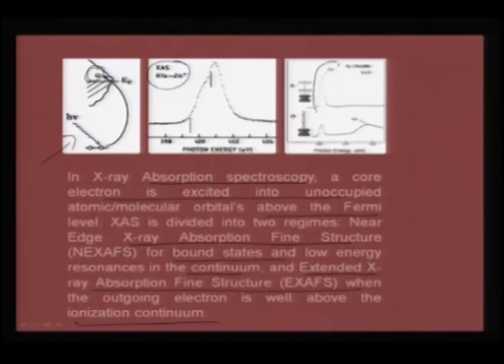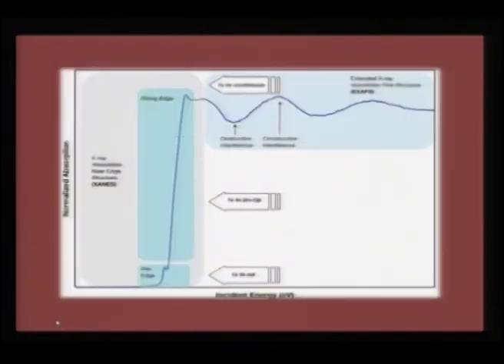In this case, you can see nitrogen is adsorbed on nickel 100, and when it is adsorbed to the surface, then you get a clear resonance for a 2 pi interaction, and this is a typical XAS peak that you would get for nitrogen 1s to 2 pi star transition. We will come to this issue in an example.